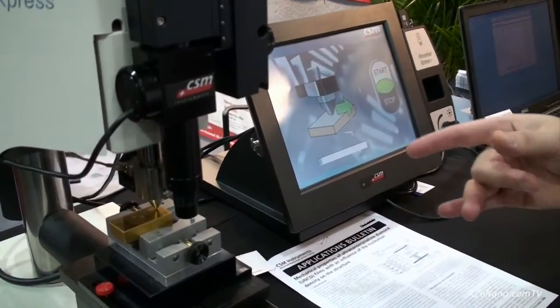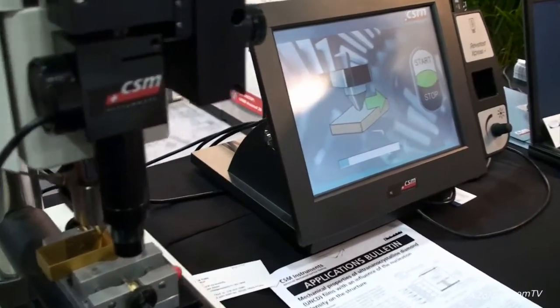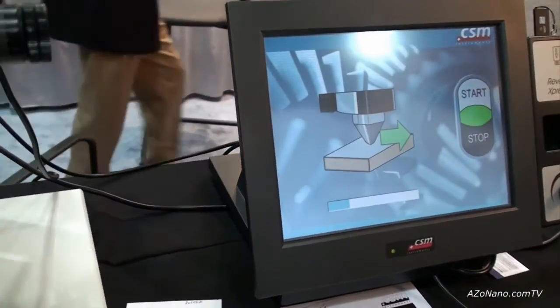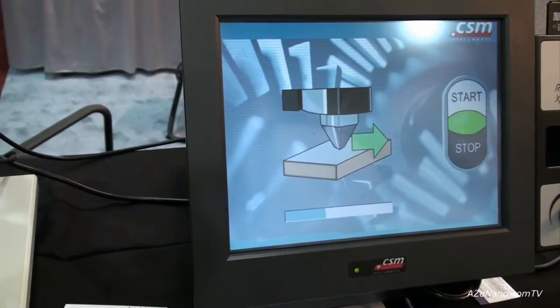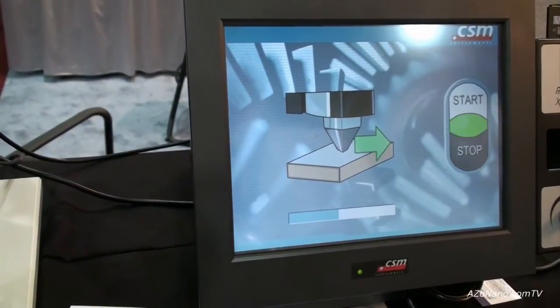As you're seeing now we just approached our diamond indenter to the surface. This is a typical sample, it's a titanium nitride coating on steel with a thickness of about two or three microns.